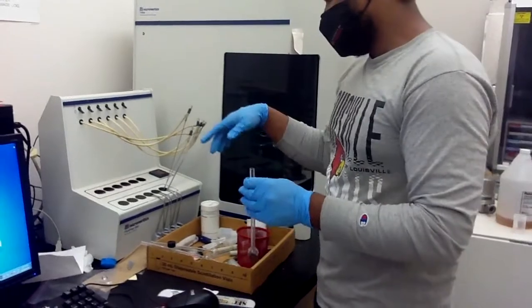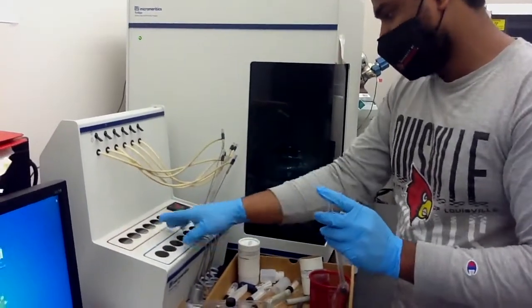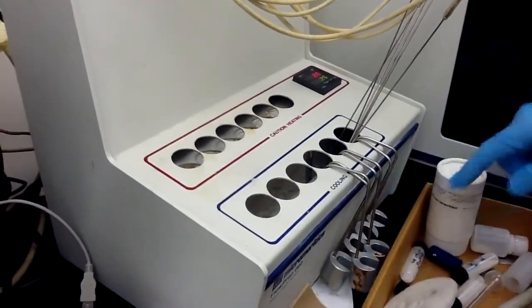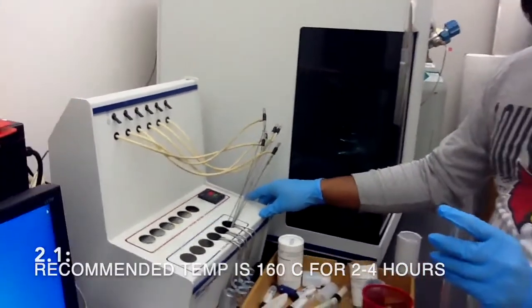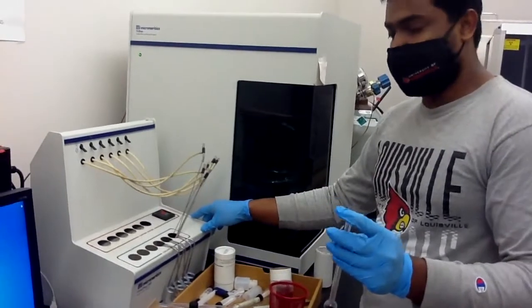Here this is the degassing machine. Just put your sample inside it. There are two portions. This portion is heating and this portion is cooling. Usually the recommended temperature is 160 degrees Celsius and the degassing time is 2 to 4 hours.